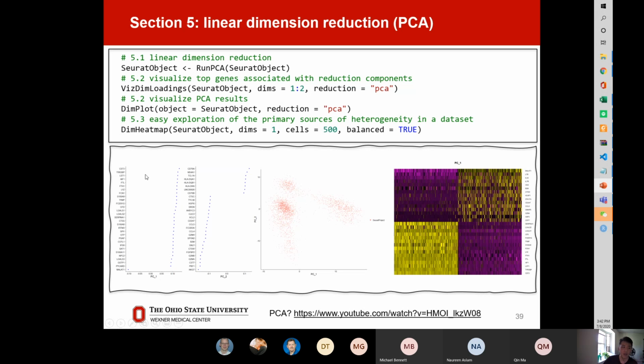Just a quick introduction: if the genes with high loading score are showing here, that means the gene plays a very important role in this dimension. For example, in PC1, I bet CST3 should occupy at least one of these clusters.